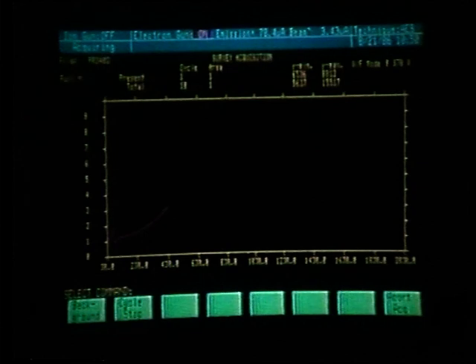Notice that the file name is PRO403. PRO402 is our profile, and PRO401 is our survey scan from the surface of this area.